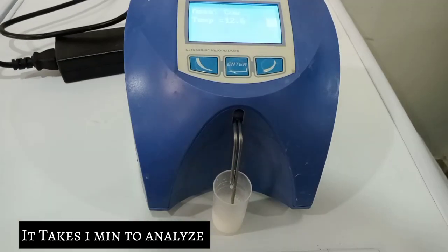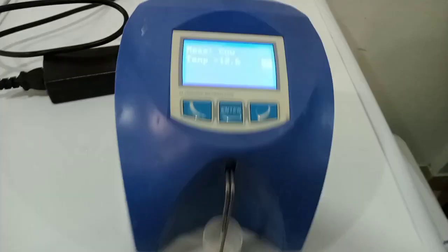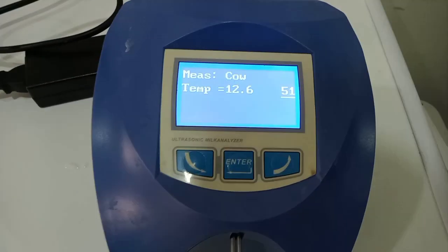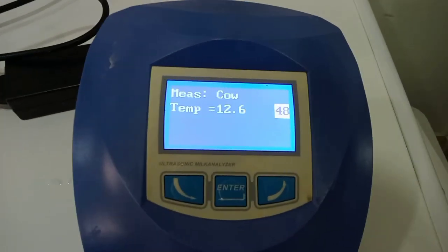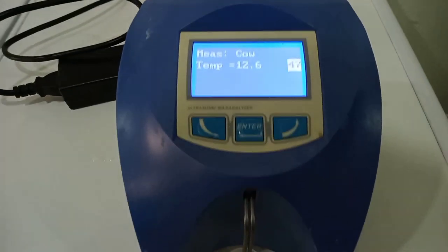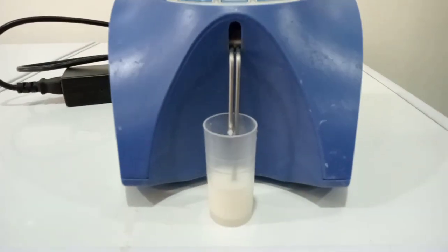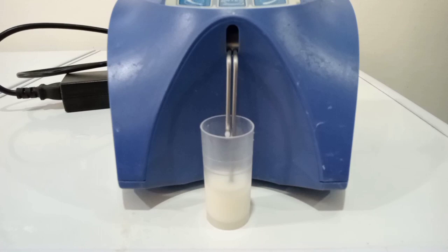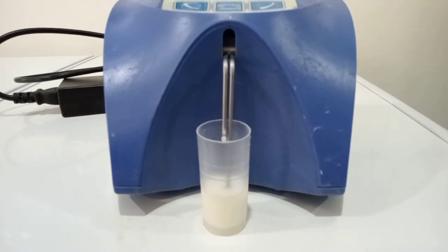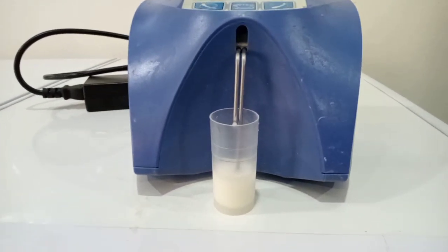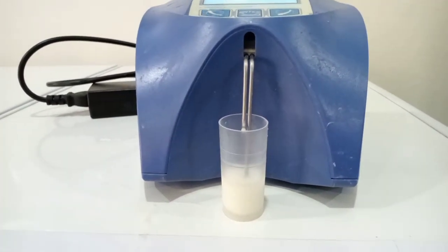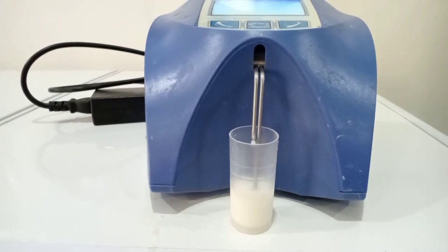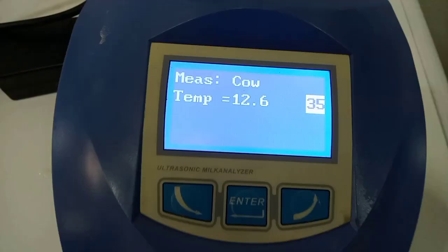This process takes about 1 minute. The machine will determine the physico-chemical activities and properties of the milk sample from the analysis.